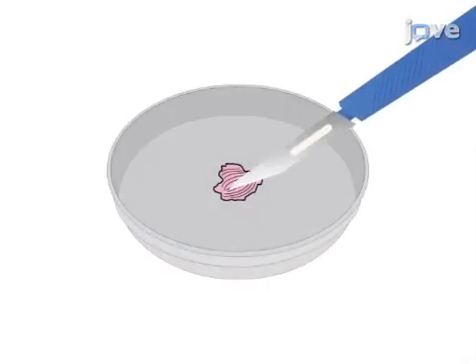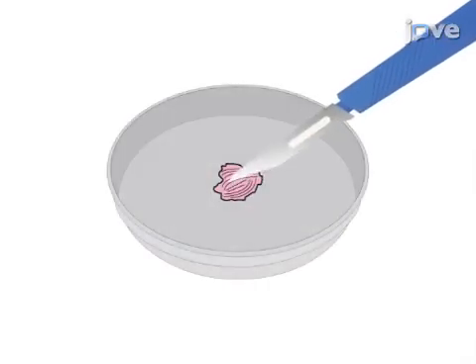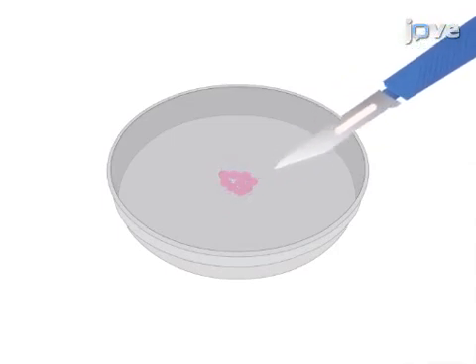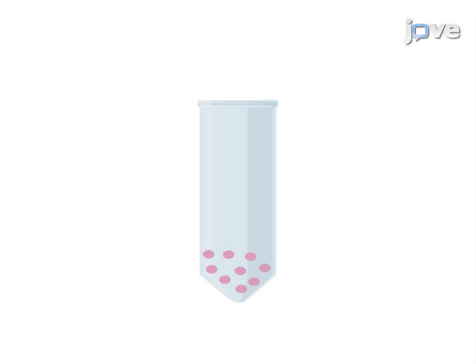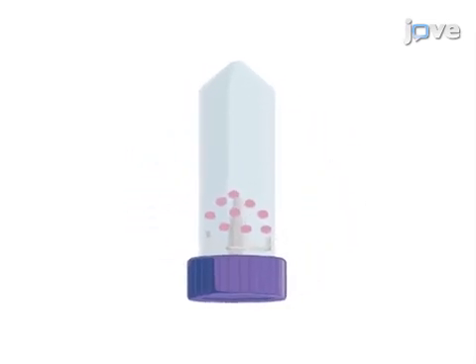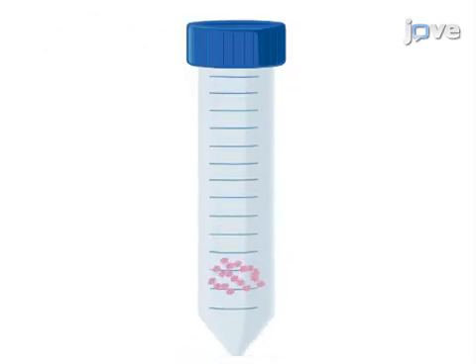This is accomplished by first using a sterile scalpel to dice the tissue fragments into small pieces. Next, the tissue slurry is transferred to a mechanical dissociator tube, whereupon the fragments are further homogenized into a single-cell suspension. The cells are then collected by centrifugation for downstream analysis.